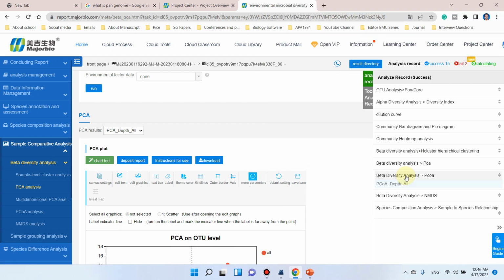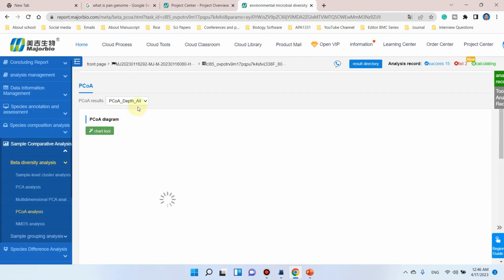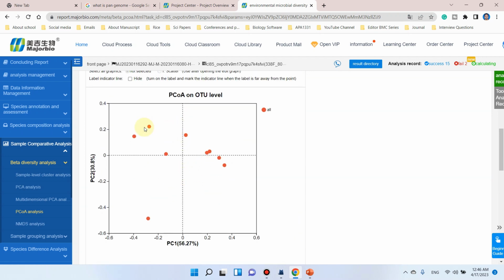If we take the beta diversity at principal coordinate analysis, PC principal coordinate analysis is similar to principal component analysis. And here you can see now our samples are easier to identify. You can see here this is sample CP3, this is sample CN3, and this is sample CN1. So it means the control negative and control positive are more linked together, because they are placed closely together.